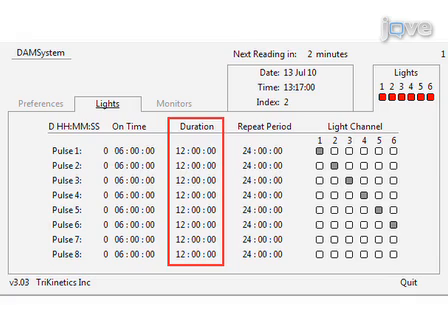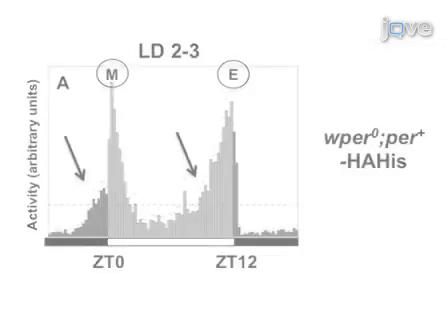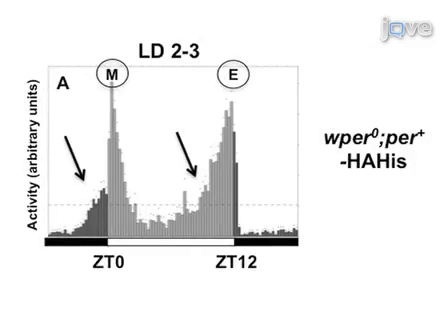at 25 degrees Celsius. For the study of circadian rhythms relative to this protocol, the time when the lights go on in the incubator is defined as Zeitgeber time 0, and all other times are relative to that value. Under standard 12 to 12 LD conditions, wild-type Drosophila melanogaster typically exhibit 2 bouts of activity, one centered around ZT0, termed morning peak, and another around ZT12, termed evening peak.